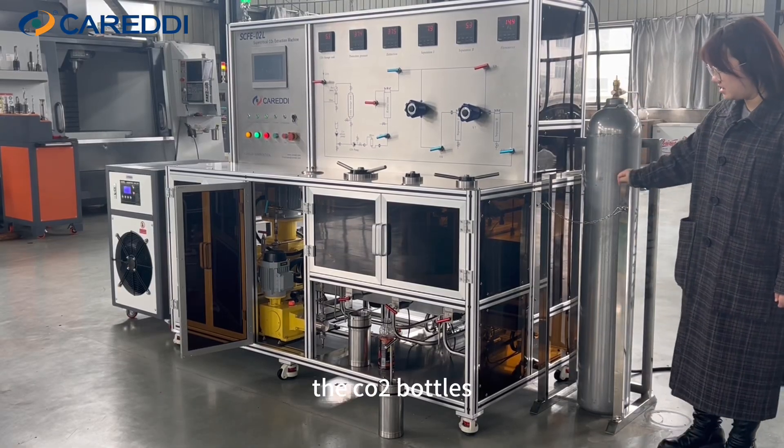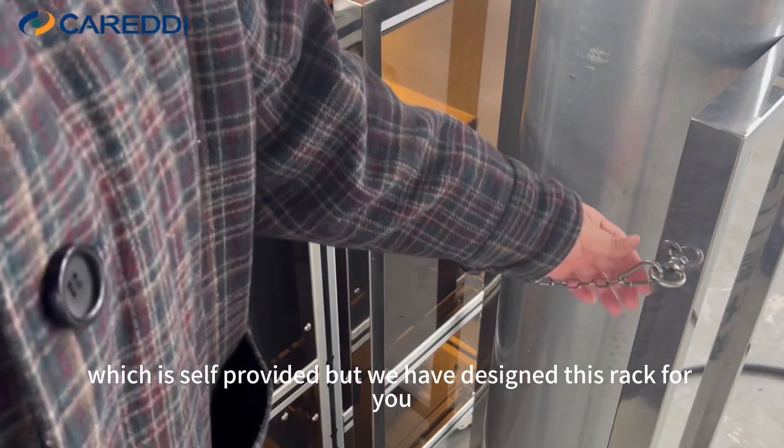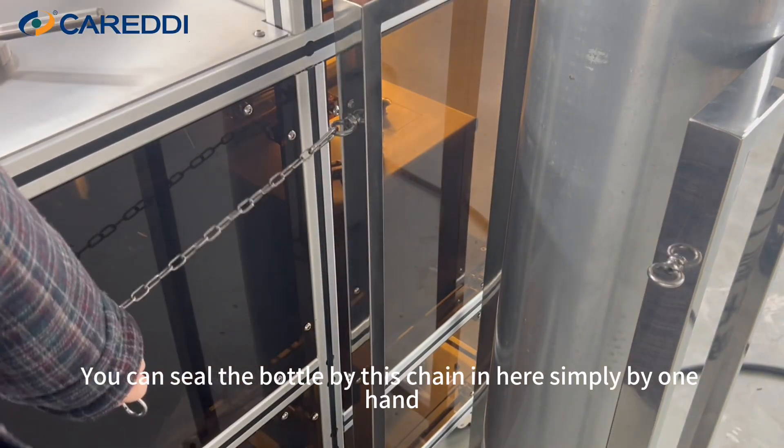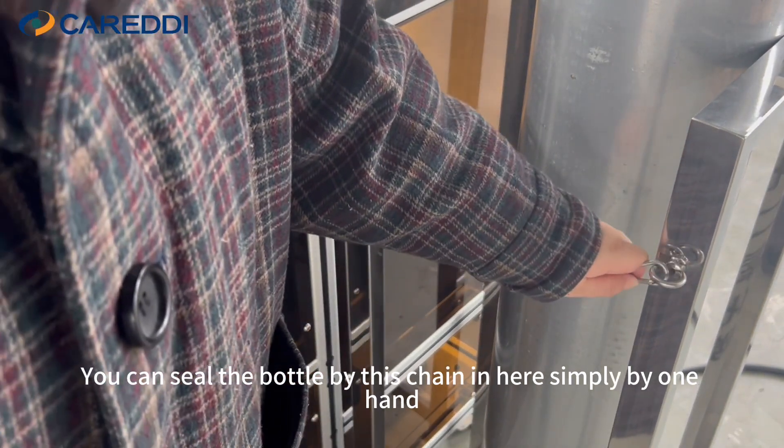Last but not least, the CO2 bottles, which are self-provided, but we have designed this rack for you. You can secure the bottle with the chain here, simply with one hand.